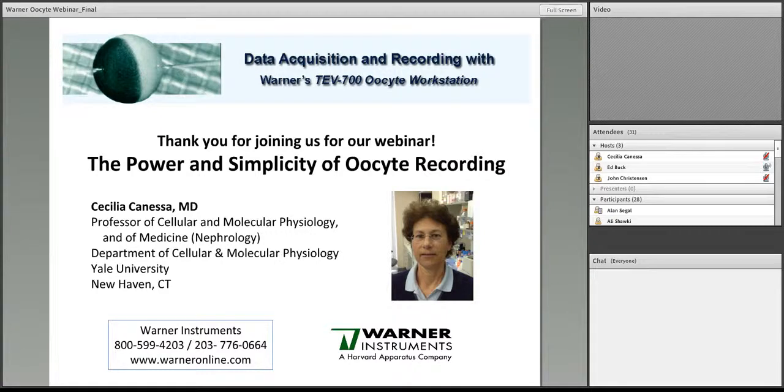In today's presentation, our speaker, Dr. Cecilia Canessa of Yale University, will demonstrate how easy it is to acquire data from oocytes using the TEV-700. In addition, she'll review several interesting recording techniques she's used over the years, and will share some interesting findings that came from using those techniques. And finally, the presentation will be followed by a question and answer period.